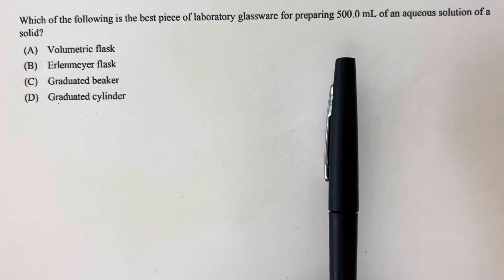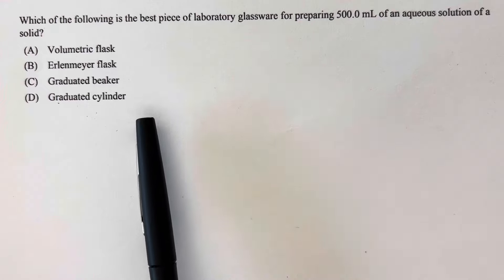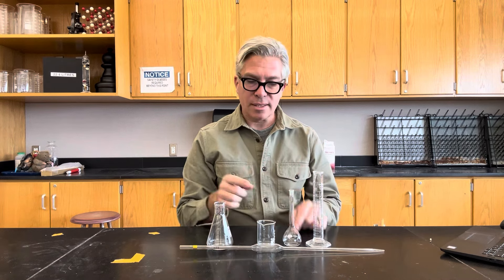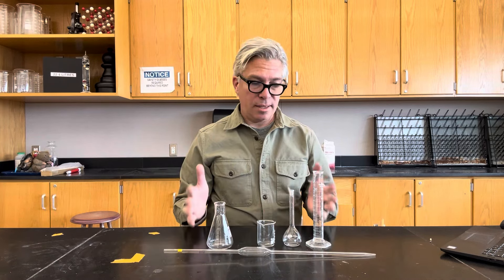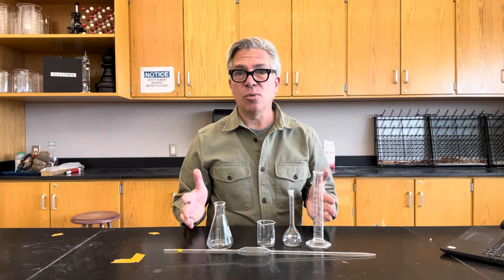If you're taking a class such as AP Chemistry, you're going to be asked questions about laboratory procedure and which glassware is most appropriate to use. So let's do a test. I have here a graduated cylinder, a volumetric flask, a beaker, an Erlenmeyer flask, and even a volumetric pipette — we'll get to that a little bit later. Each of them tells me I can measure something to 50 milliliters, and that's what I want to do: measure 50 milliliters of water in each one and see how much it weighs.